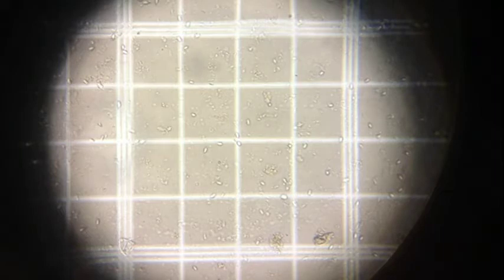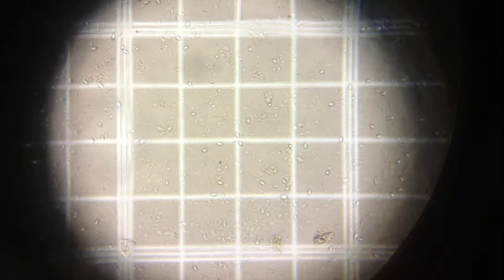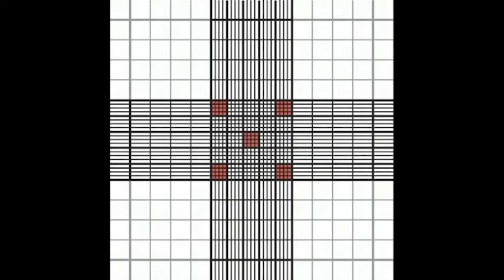If a Nosema spore falls within the border grid lines, do not count the ones that lie within the left and bottom border, but do count the ones that lie within the top and right border. Move the slide around and count all spores that lie within each corner square and the very middle square of the grid. Record the total number of spores.